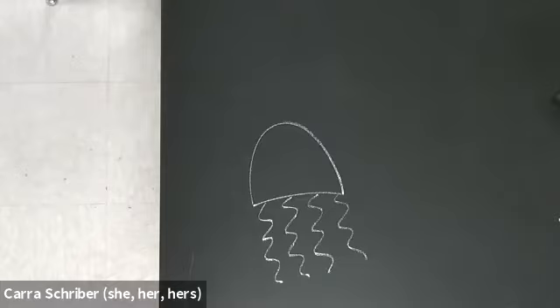Let me find the microscope slide for that. Okay, sorry about that, I found it.